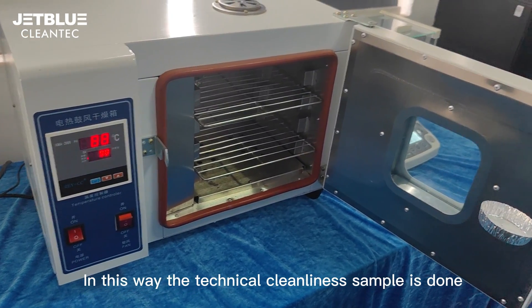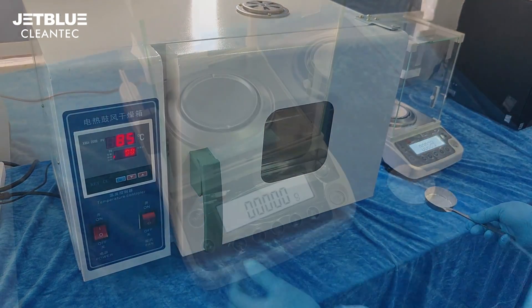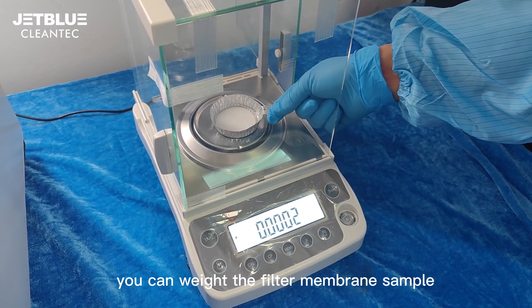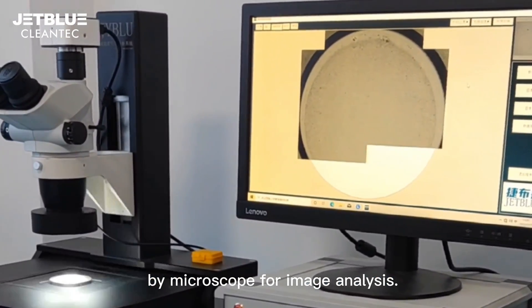In this way, the technical cleanliness sample is done. After the sample is prepared, you can weigh the filter membrane sample or scan it by microscope for image analysis.